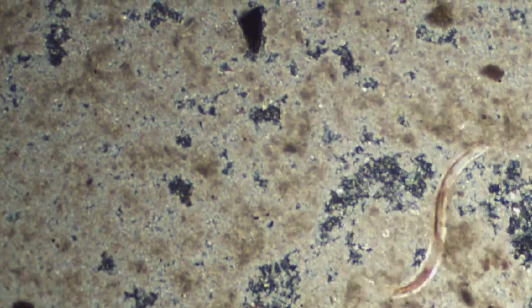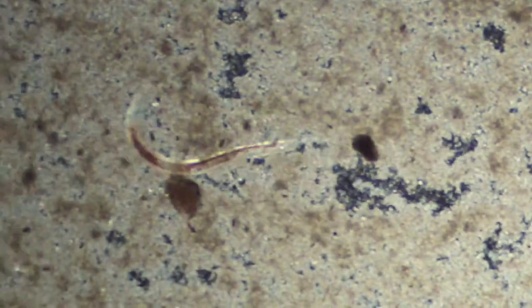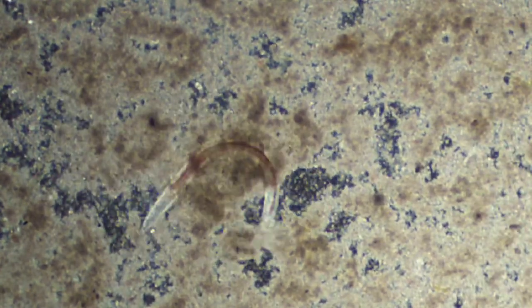See how it just moves through the muck? That motion works perfectly. Other critters have to struggle because they're stiff or blunt or whatever, and this just goes shoo. That's why I wanted to show the muck. Coursing through the muck with no effort. That motion really works. It's the secret to their success. Nematode crazy.